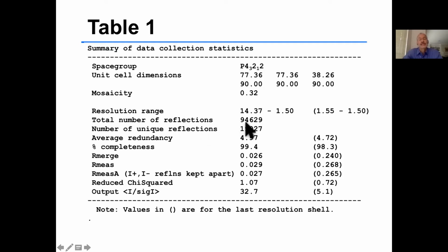So in this case, we have measured things on average about 5 times each, and that's called the average multiplicity or the average redundancy. Or if you read the CCP4 news group, they're saying, of course, in Europe redundancy, or in the UK redundancy means something else, and maybe replications is being used nowadays, or I haven't followed it closely, but maybe there's more terms.